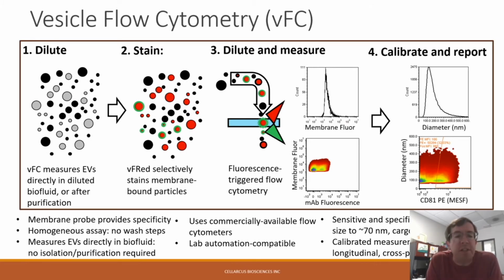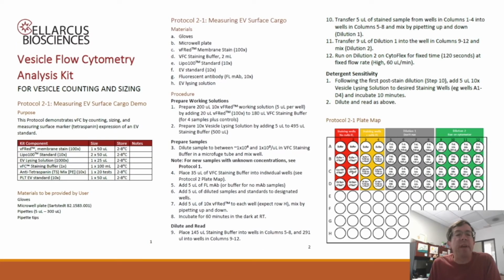It is a fluorescence-based assay that employs a fluorogenic membrane probe to selectively stain membrane particles, and together with properly validated fluorescent antibodies, enables the selective detection and immunophenotyping of individual vesicles. Calibration of both vesicle size and immunofluorescence are key to that, and I'll get to those next.